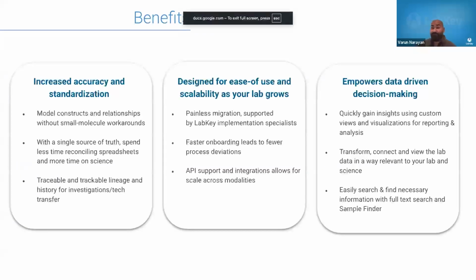But even hopefully, just with that glimpse, you could see the benefits of having an all-in-one solution, just like Biologics LIMS. And just as a reminder, those benefits are increased accuracy and standardization. So think being able to track all of your data all in one place with full traceability and transparency.